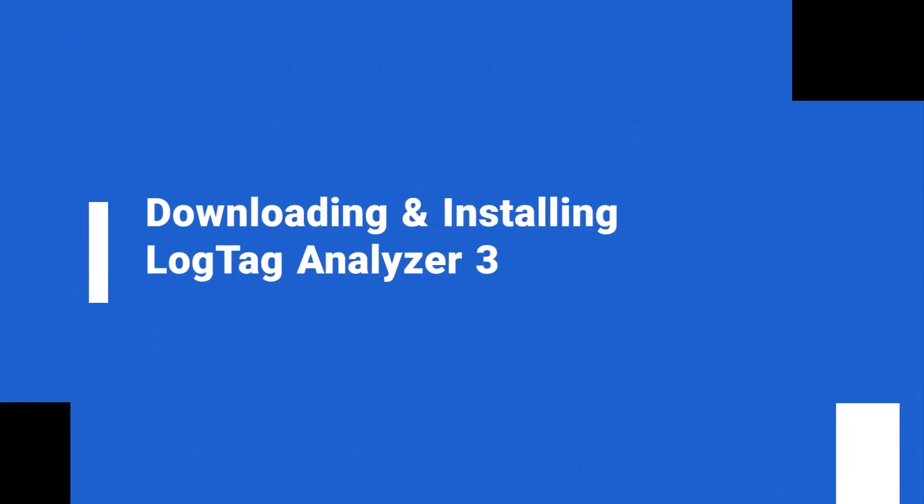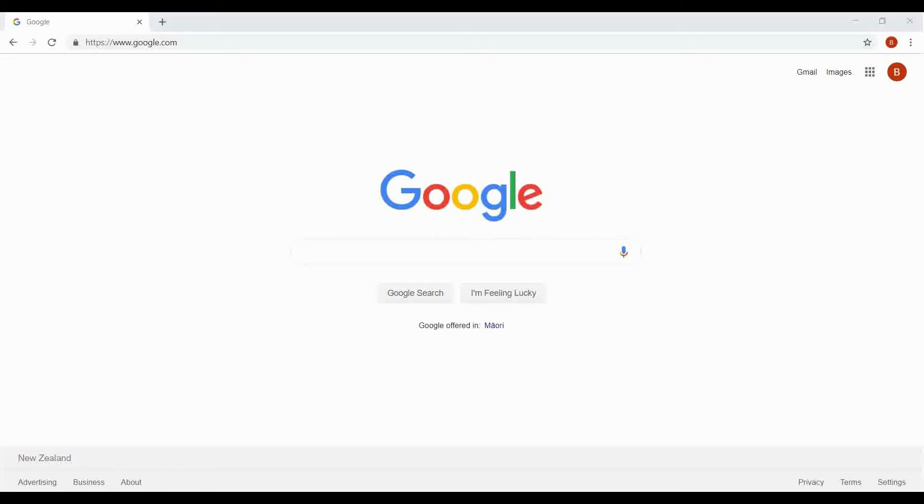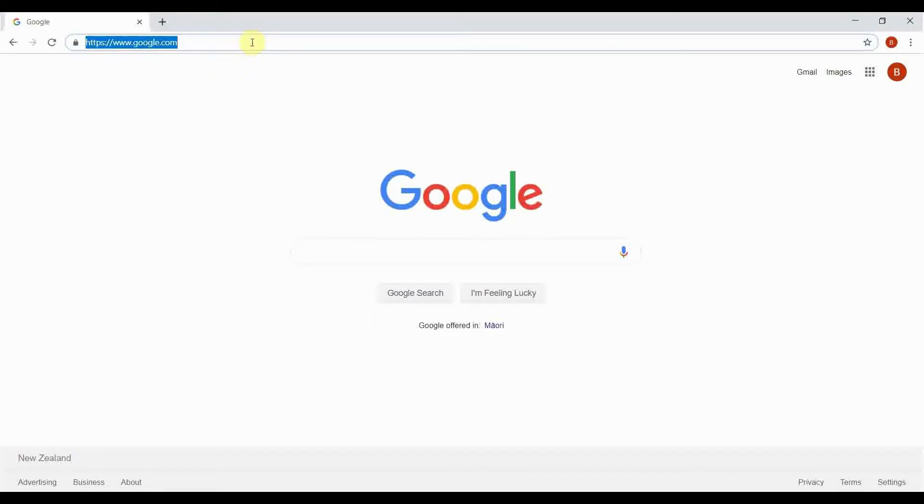To configure your device, download the latest version of our free LogTag Analyzer software. Click on the link in the video description below or browse to our website at LogTagRecorders.com.